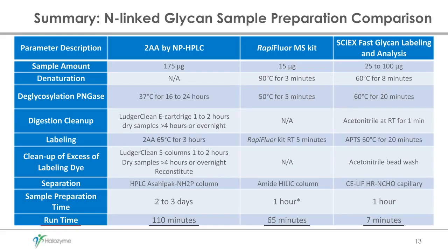We haven't done too much work with the SCIEX, so I can't really say how many injections you can do with one capillary, but based on our experience with the previous kit, you can do hundreds of injections without any issues. So anyway, I'm not going to go through this table. All this information is here, and it's pretty much just a compilation of the previous slides. But I did want to focus on those two things that are very important for us.